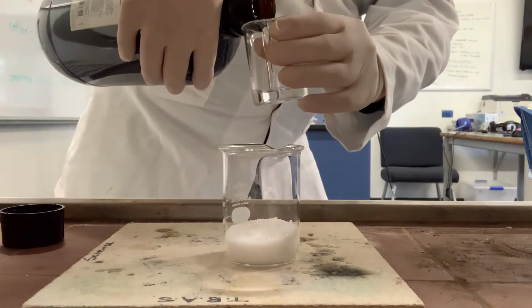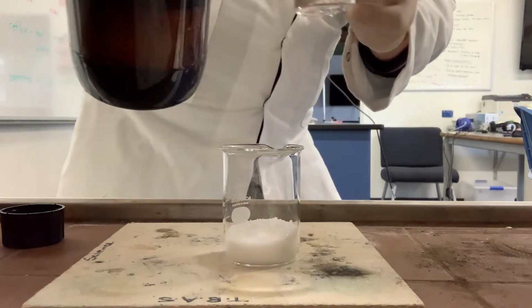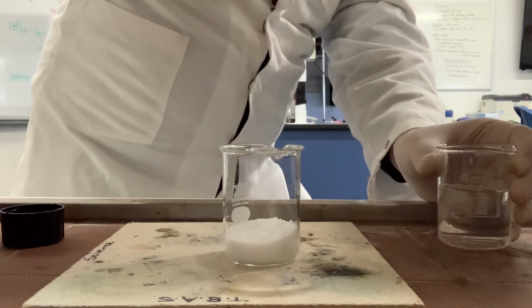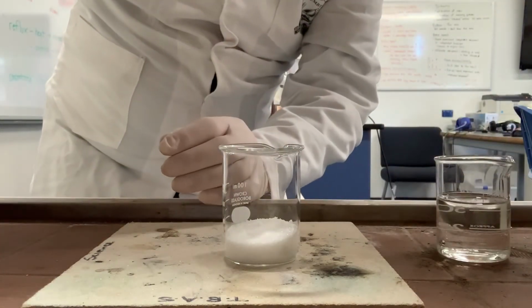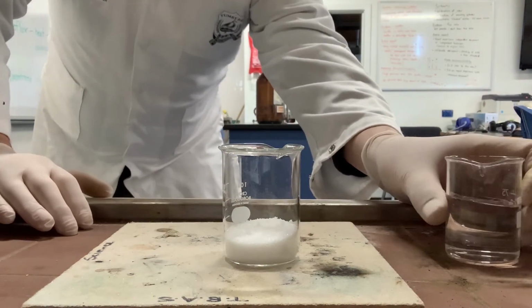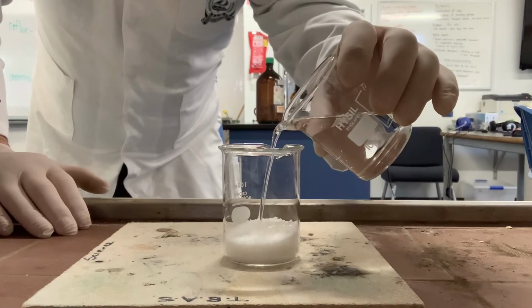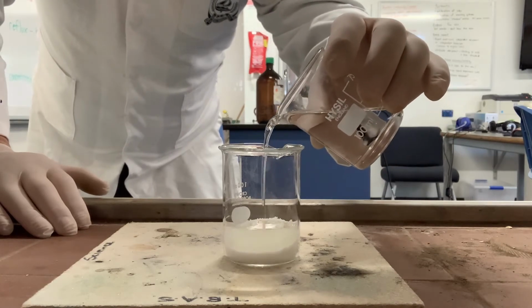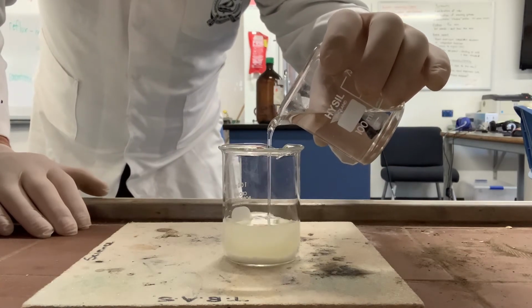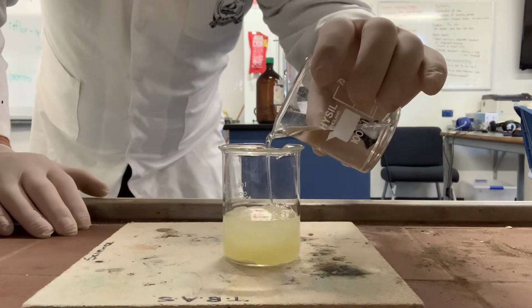I'll just carefully pour that into the beaker. I need a little bit of this for later as well. I'm getting it out, but I'll do this demo as well while we can. And if we pour this sulfuric acid into this sugar, like so, and just let it soak right through.